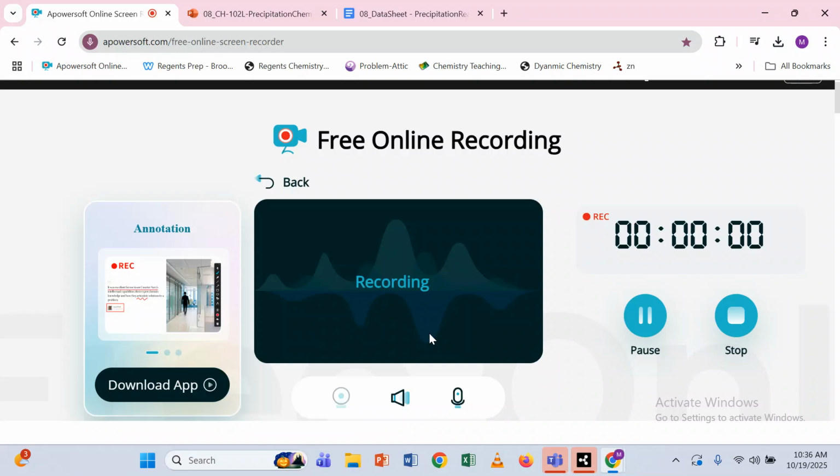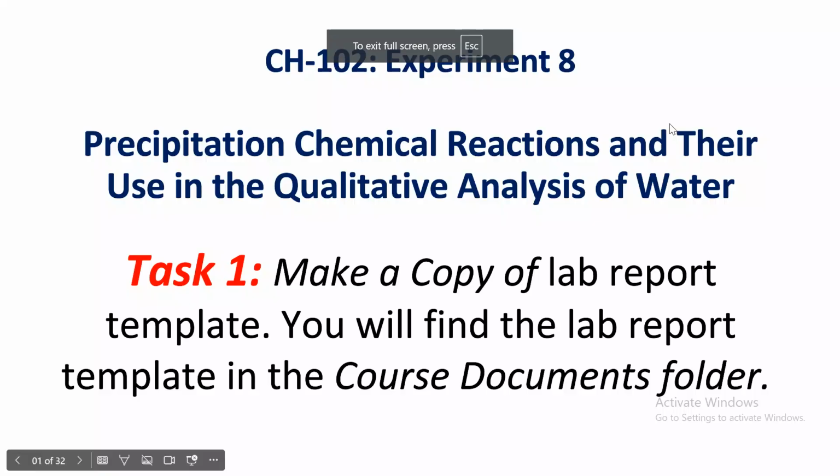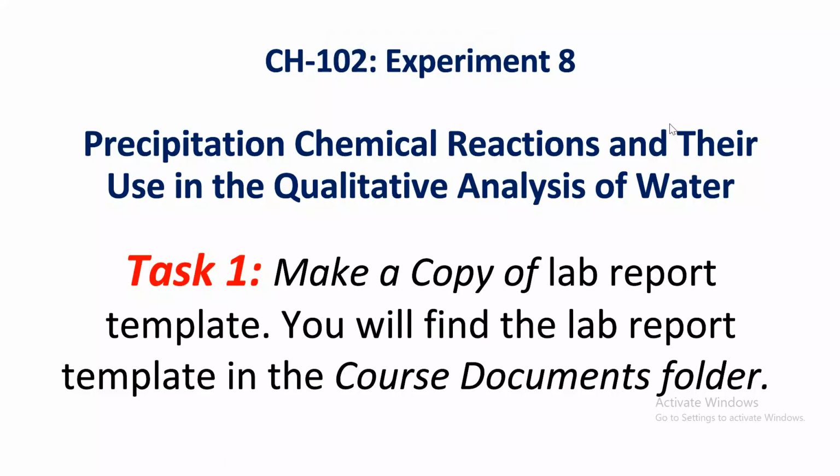Welcome back, everyone, to Chem 102. My name is Professor El Hawari, and today we will be going over experiment number 8, precipitation chemical reactions and their use in the qualitative analysis of water.